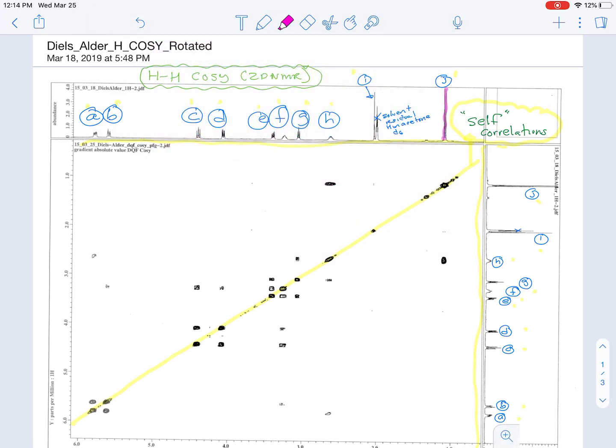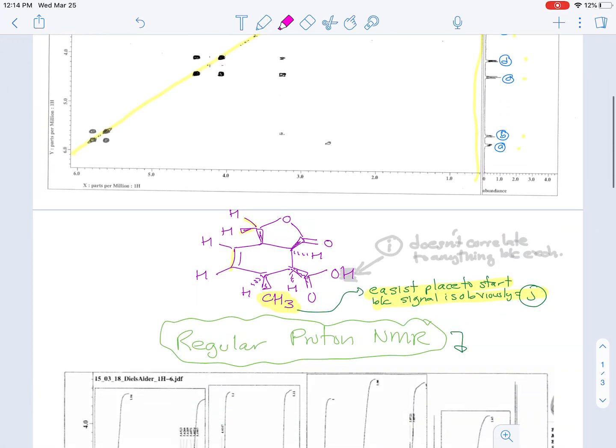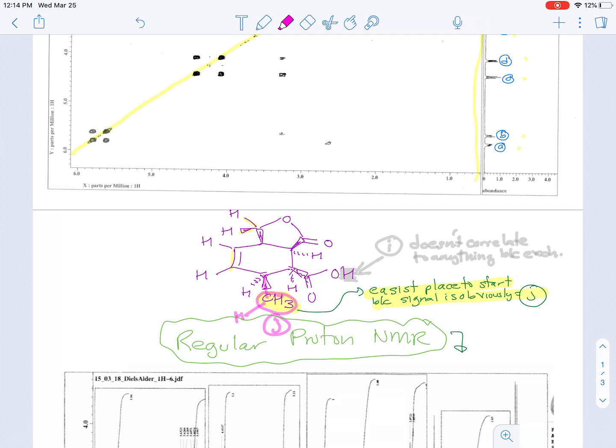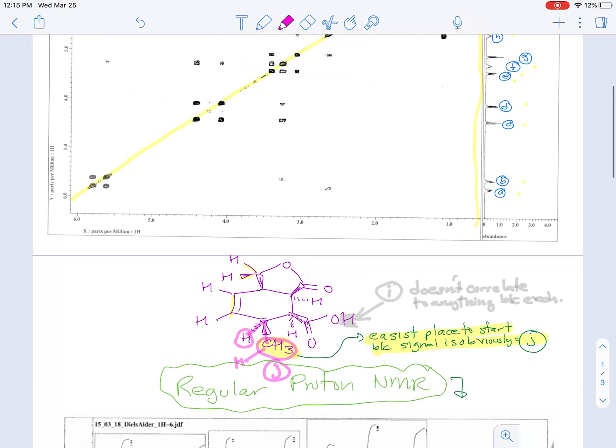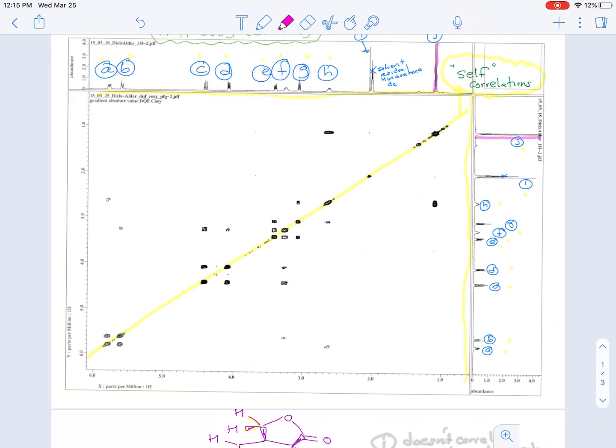So signal J here is for this methyl group. So that's the easiest place to start. And if you look at this signal which we've now identified as J, if we go two bond or three bonds out - one to the H, two, three - will take us to this H. So signal J should correlate to whichever signal corresponds to this proton.